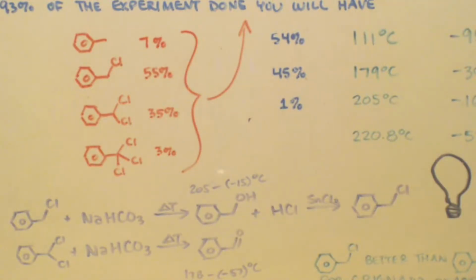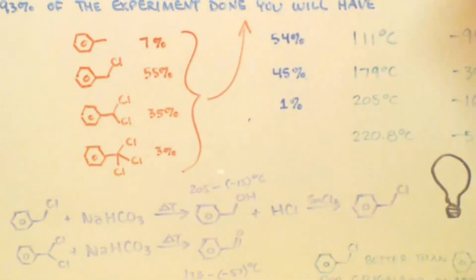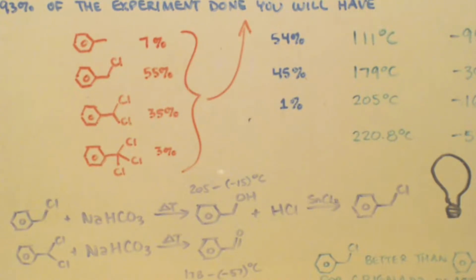Now, for the benzyl trichloride, that one's an easy one because you just put in a little bit over 3 moles of chlorine and 1 mole of toluene, and you just let it react. Now, the thing about this reaction is because you're making free radicals, they are really extra reactive. As soon as you make them, they want to do something. They're going to attack anything.